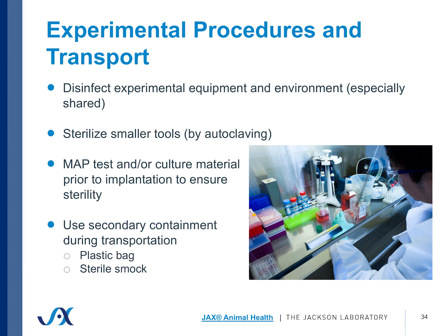Anytime you're going to be doing engraftments of any tissues, again, it's a potential source of contamination or potential source of pathogens for your mice. So if you're going to be engrafting a cell line, say you get a cell line from a colleague, do MAP testing, the mouse antibody production testing, on it, and make sure that it's going to be safe and it's not carrying mouse pathogens before you engraft it. Lots of institutions have regulations about this, and it should be done, but check and see if it's part of it in your facility.